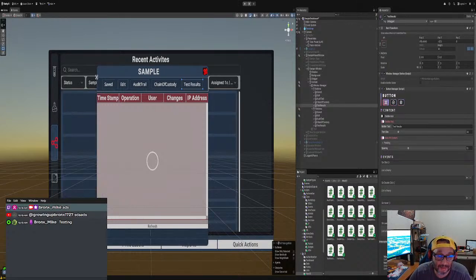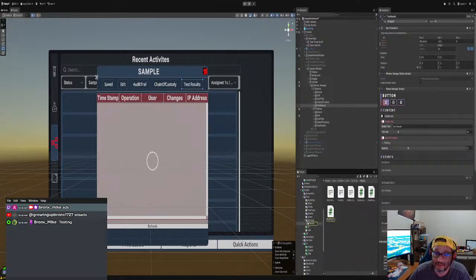All right. So I got that part down, right? And now when we hit play, it runs. Correct? Now when we hit play, it runs.